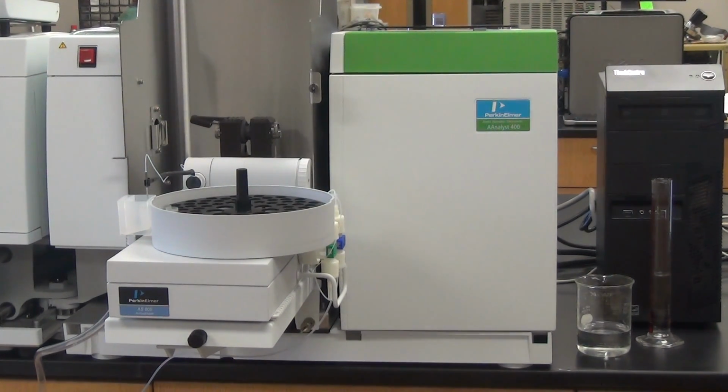What you do is you use 50% isopropanol and water, and let it evaporate a little bit. You see we have a buildup there. That buildup, if you're running really nasty samples, will cause it not to dry correctly. The contact cylinders can cause that problem, and if they're just dirty, it can cause that problem too. So get some Q-tips, don't buy those high dollar things. In fact, I saw a box of Q-tips here somewhere.